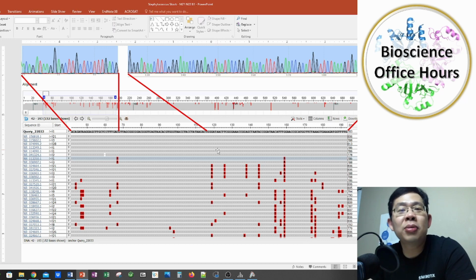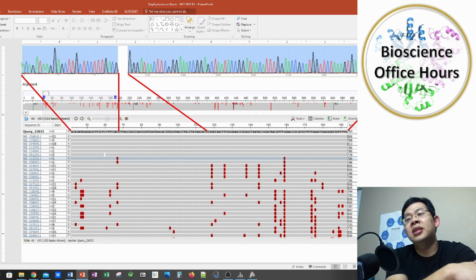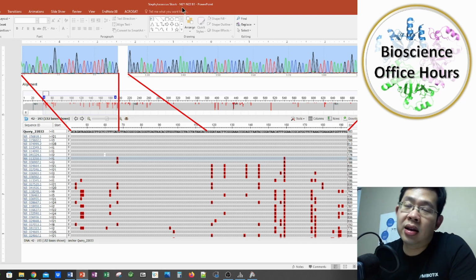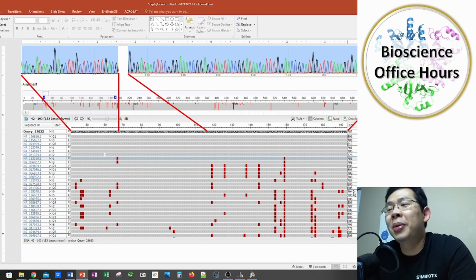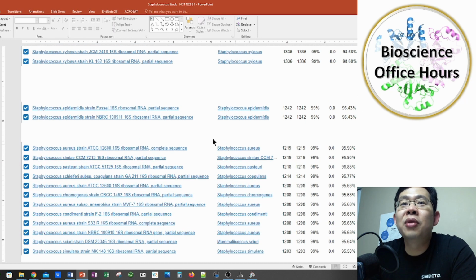If there's a new lab tech or a new professor who wants to know the identity, they can simply open this file, the documentation on that, and just see this is definitely not Staphylococcus epidermidis, because if you look at Staphylococcus epidermidis, it's actually really way below that.